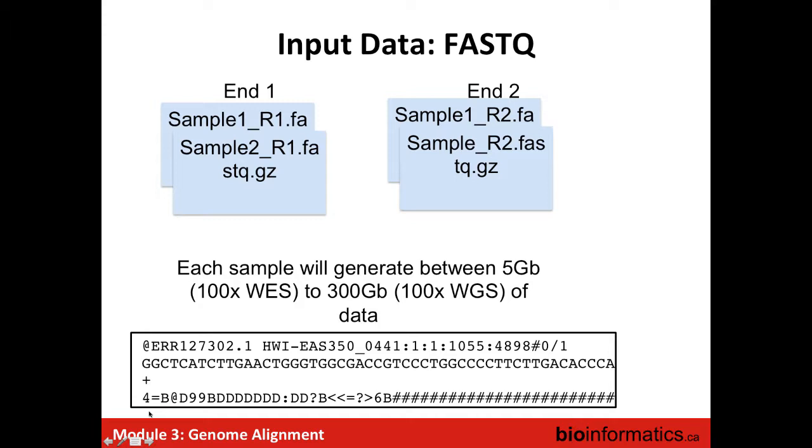You will see that for each base you have a quality value which is a single character, because you can imagine that if I had a quality value of 100, I wouldn't know which bases the characters correspond to. So the value you have here is one letter, and it represents the ASCII value of the letter. So 4 doesn't mean it's four. You need to go to the ASCII table and find the ASCII value of the 4, and you will have the quality of your data, plus or minus a base offset, but we'll see that later.